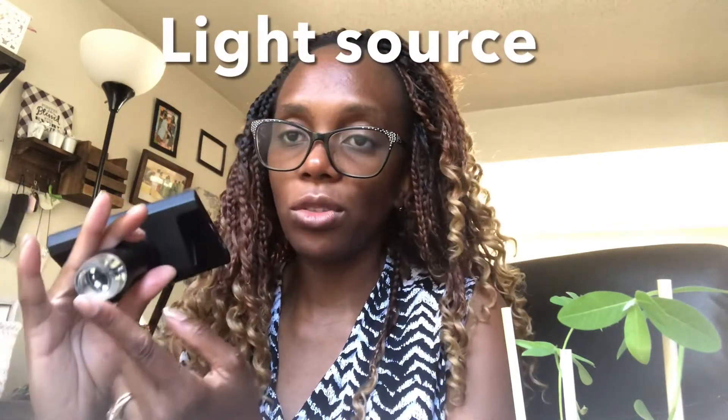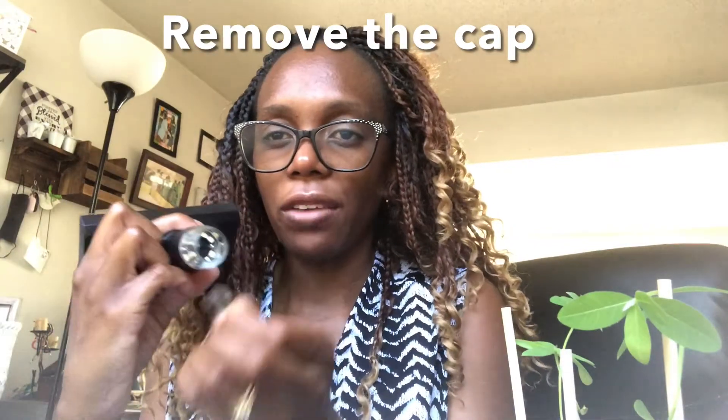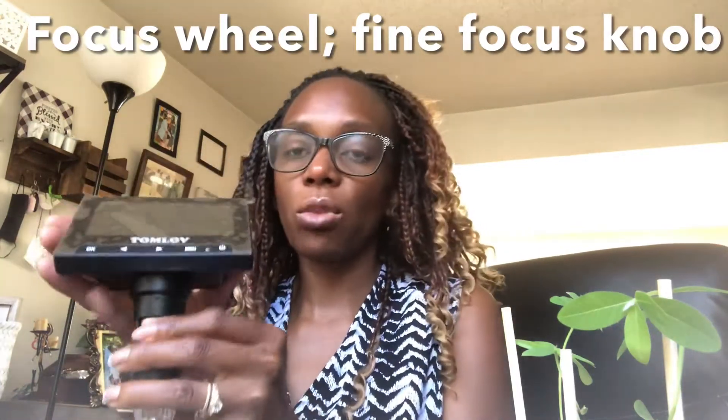On the side you have a light adjustment that helps you control how much light comes through, because the light source is inside the microscope. When it first arrives it's actually covered, so you have to remove that cover. Down here you have a focus wheel — comparing to a traditional compound light microscope or dissecting scope, this serves as the fine focus knob. Behind here is a section where you insert a memory card, which we need in order to view photos and videos.